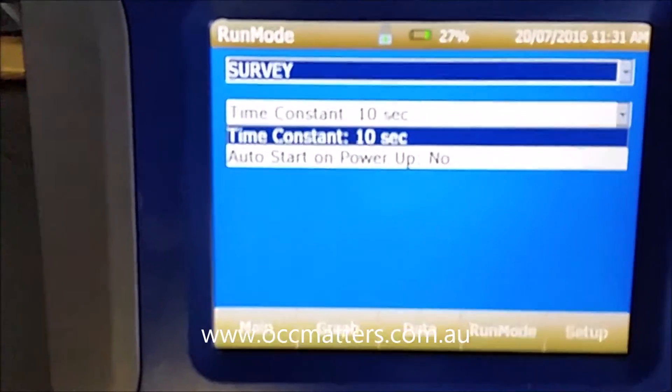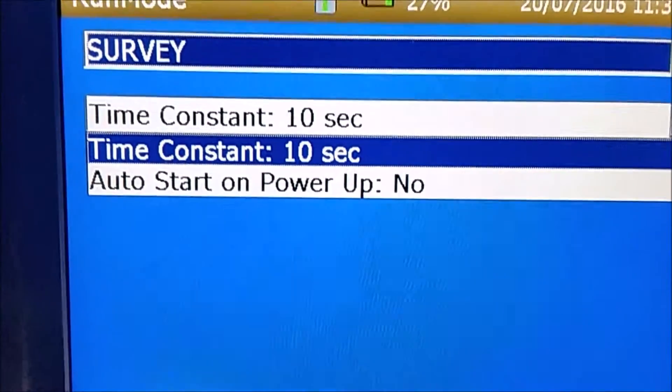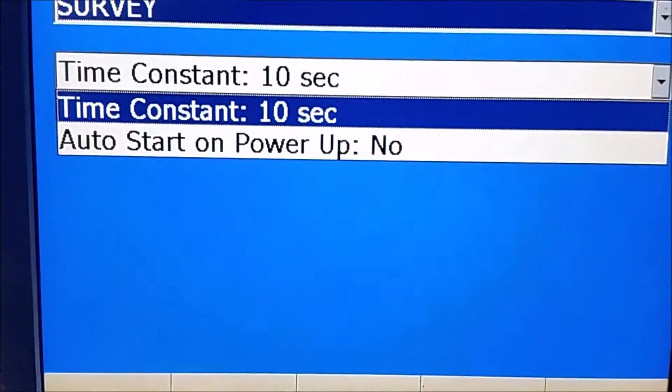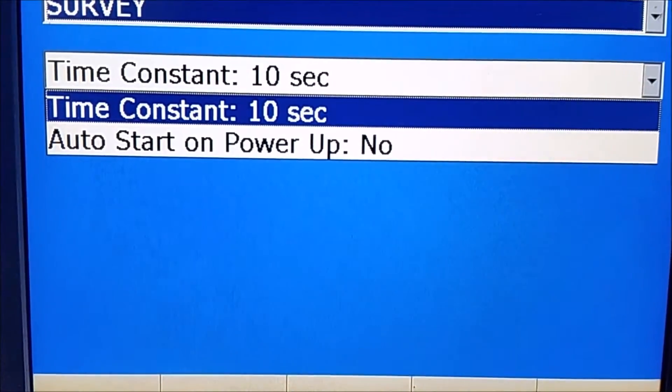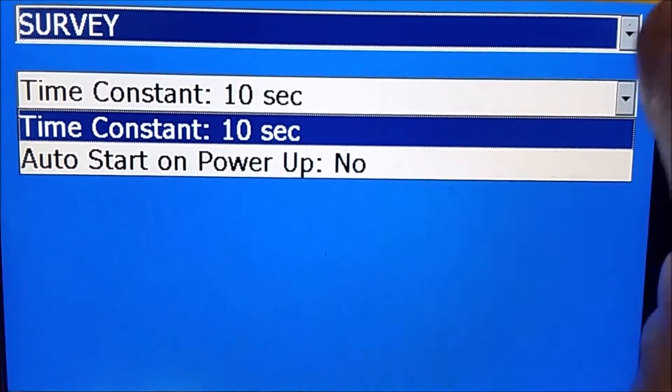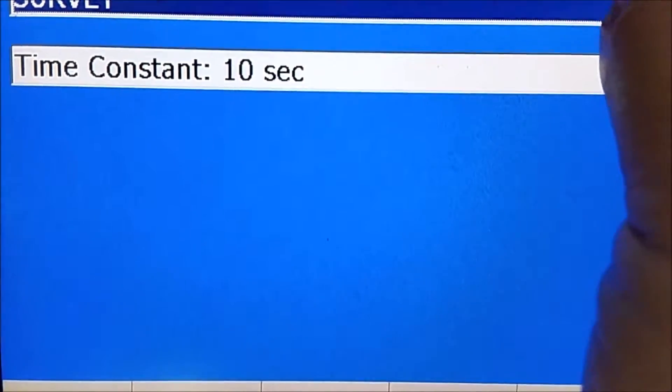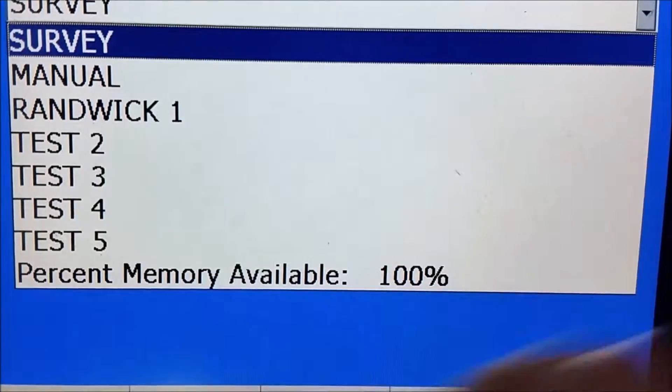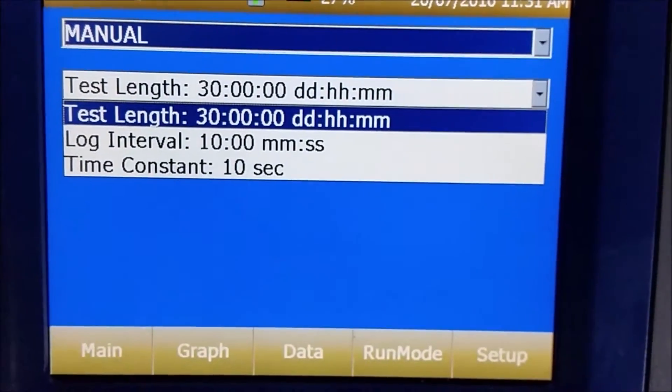If you actually want to use the equipment to save the data over a 24 hour period, you can actually go into manual mode.